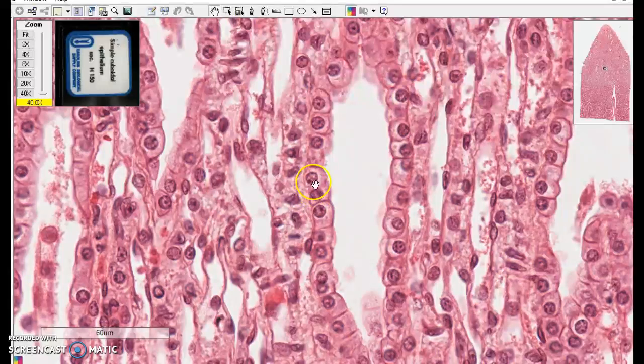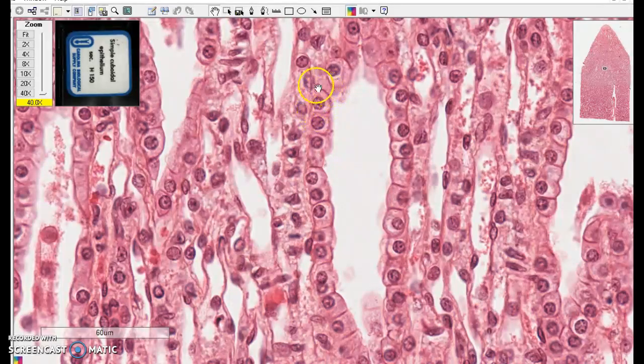Just trust me, sometimes people are worried that maybe these are stacked but they're not. So here's a single cell. You can even see the borders of the cell pretty easily.